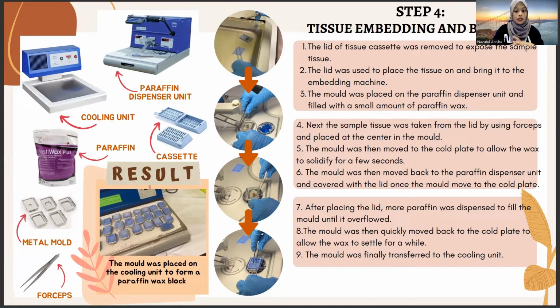The mold was then quickly moved back to the cold plate to allow the wax to settle for a while. Last but not least, the mold was finally transferred to the cooling unit.